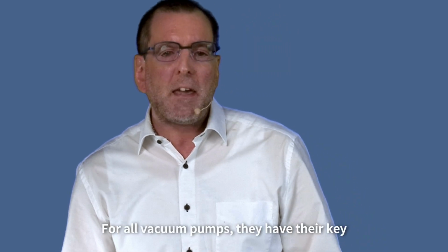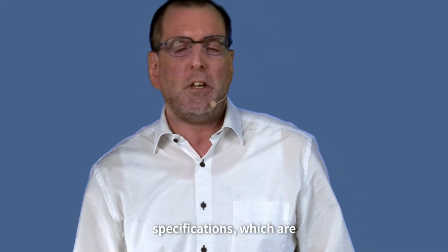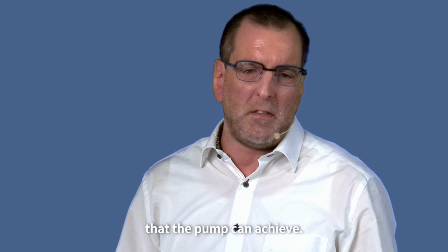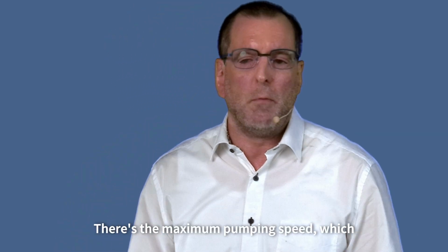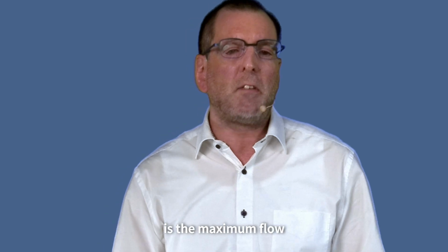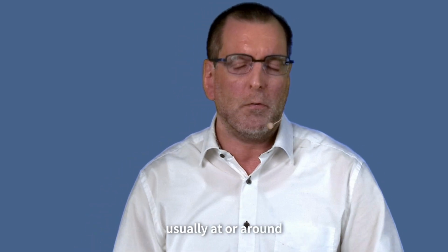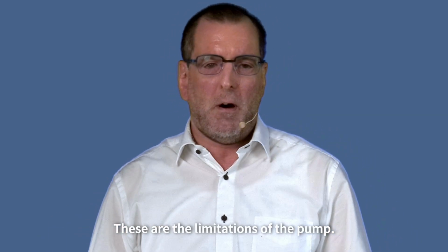And for all vacuum pumps, they have their key specifications, which is the so-called ultimate vacuum, that is the best vacuum that the pump can achieve. And there's the maximum pumping speed, which is the maximum flow that the pump can carry, usually at or around atmospheric pressure. These are, let's say, the limits of the pump.